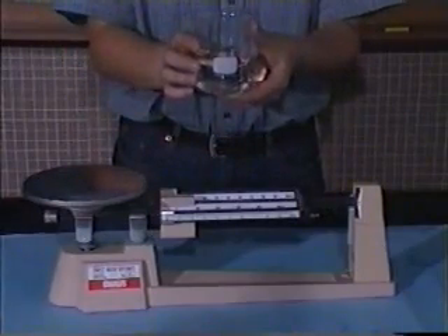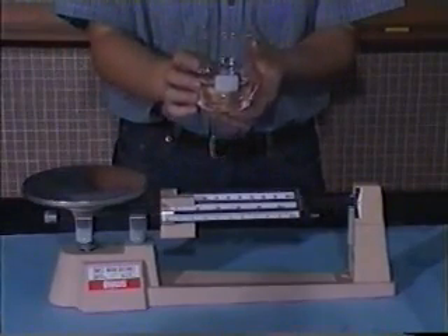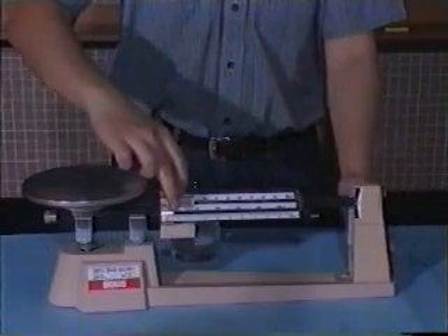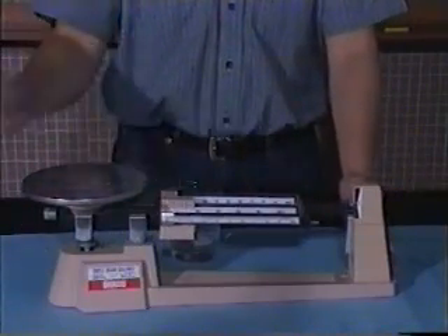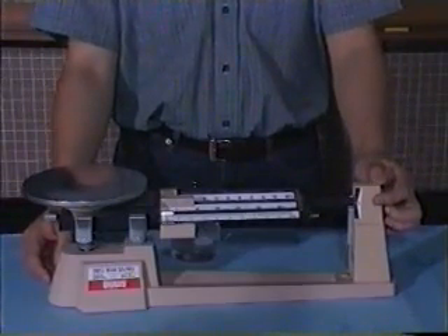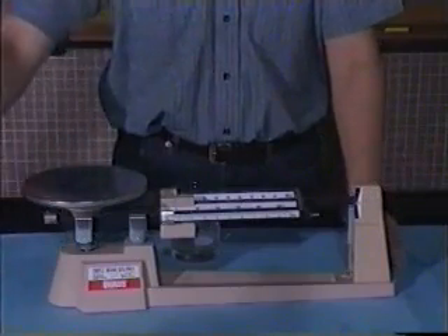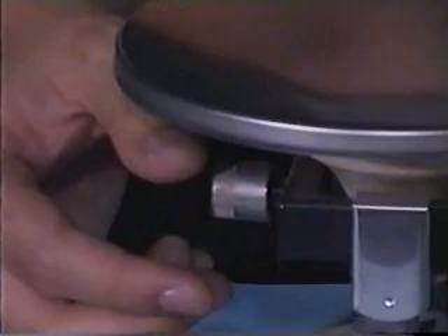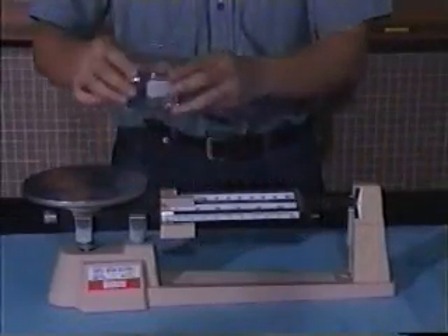How can we measure the mass of the water? First of all, we place the masses to the left. The pointer should point to zero. If the pointer is not pointing at the zero mark, we should wind up this part and reset to zero. Then place the object onto the tray.